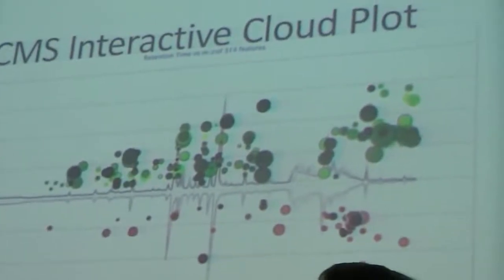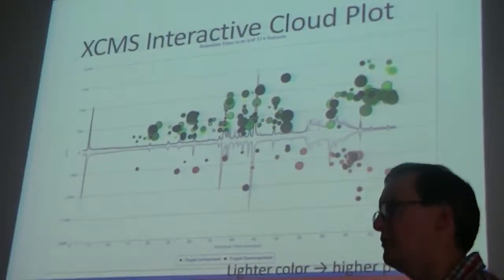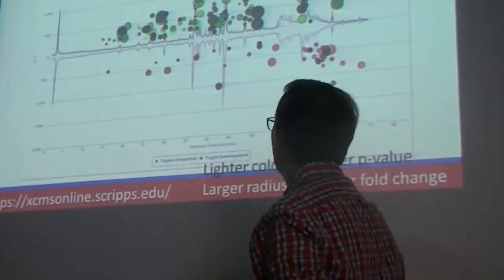One of them is this plot. So the first is that we have a total ion chromatogram. Now, I've already told you chromatograms are a very, very important concept for today. The total ion chromatogram is quite different. Instead of showing the intensity trace for one particular ion, we're showing the intensity trace for all ions to say how much intensity was seen in these MS scans as a total. And as you can see, we have this kind of blast of noise at the start of these, and then we get some spikes in here. These are kind of where the bulk of the ions we really want to analyze show up.